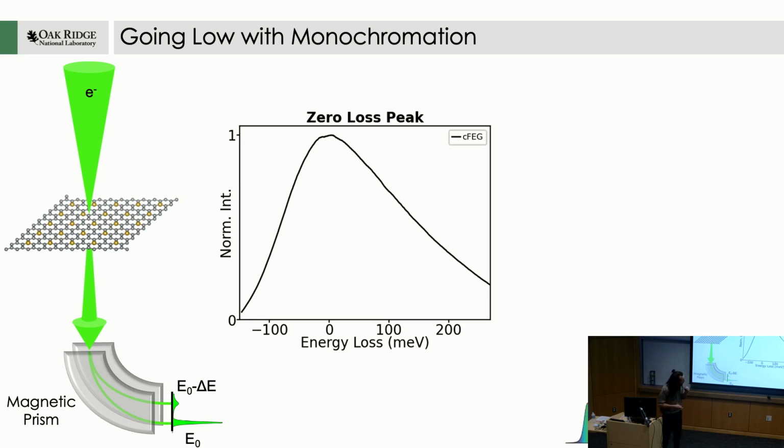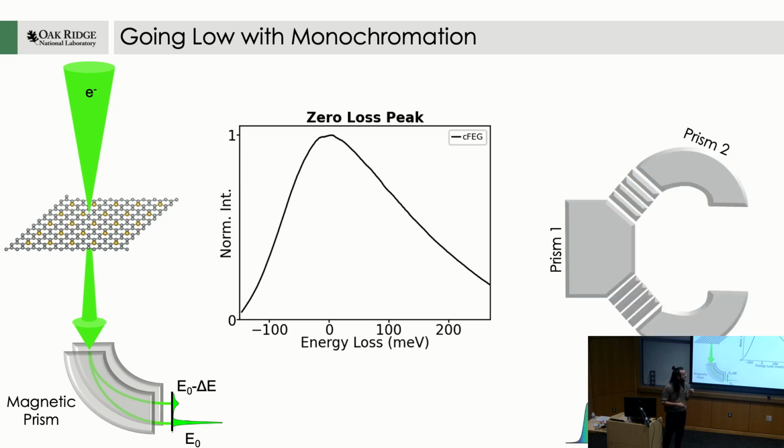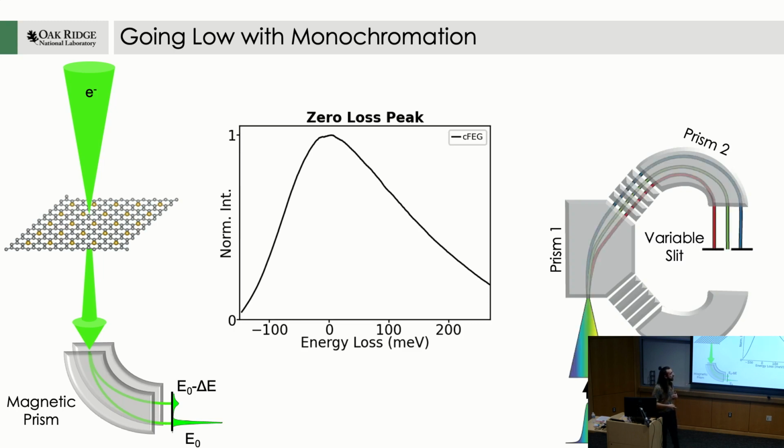So what we do is we take our 300 millielectron volt zero loss peak, and we basically put it through two EELS spectrometers that have just been stapled back to back. The first EELS spectrometer creates the zero loss peak at the midplane of the monochromator. So it essentially just disperses the beam and creates this zero loss peak in real space. Then we have a physical slit that only selects a narrow band of those electrons, and then we undisperse it and pass it back into the column. And this allows us to go down to around 5 millielectron volts in our instrument.